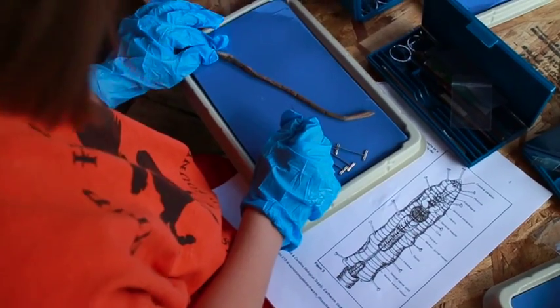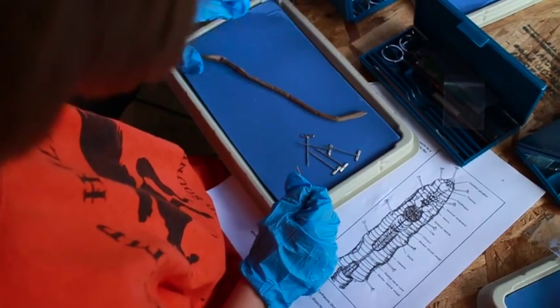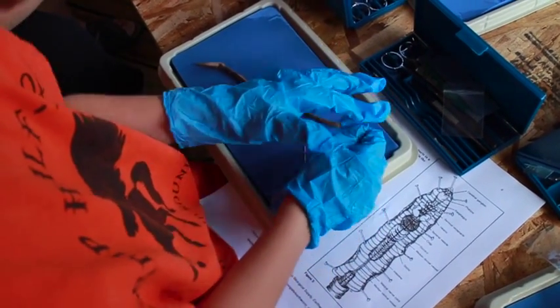So in the nine specimens, we are starting with the most simplest. Even though it wasn't that simple, it was an earthworm. The earthworm was very kind of complicated, but it was the most simple one. So I fear for how complicated the next ones ahead of me are going to be.